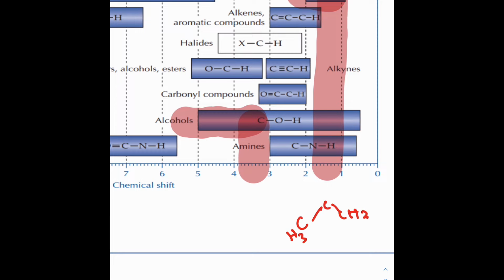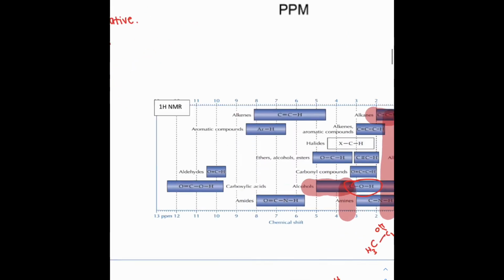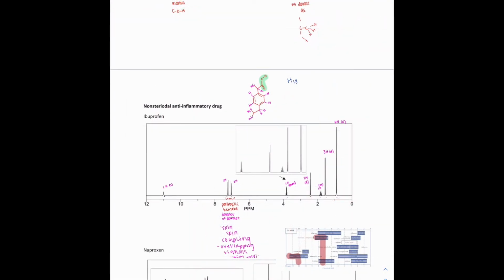And we have that our carbon and OH, and that's really what this is showing us. So this is very helpful in determining, okay, where do the hydrogens fall on the NMR, what's their chemical shift, and what does that mean? I went ahead and wrote some notes on this, but I will go over them.